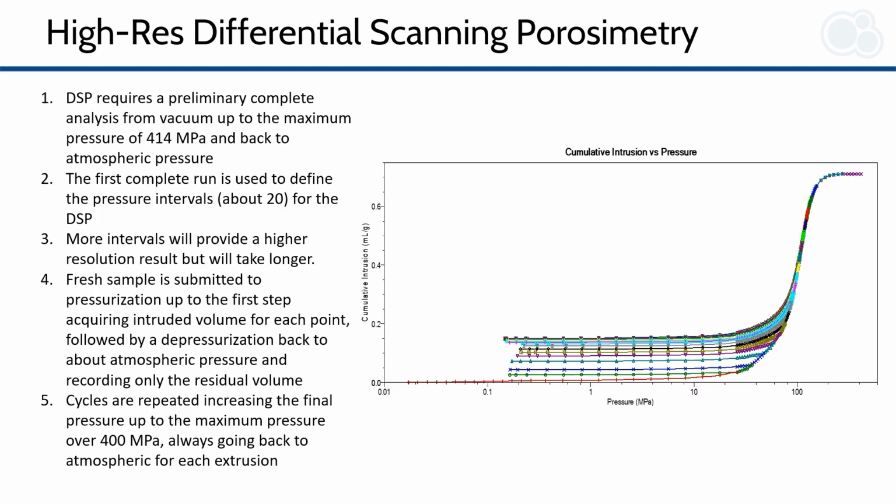The current investigation was undertaken to try to provide high-resolution distribution of pore cavity volume as a function of pore window or throat size, as well as a separate pore throat distribution, again using intrusion and extrusion cycles, but this time not initially saturating the test specimen with mercury, but rather building up the intrusion-extrusion cycles from low pressure.